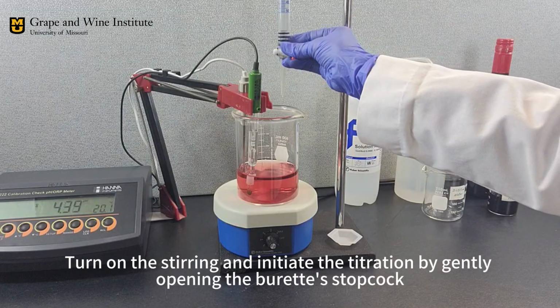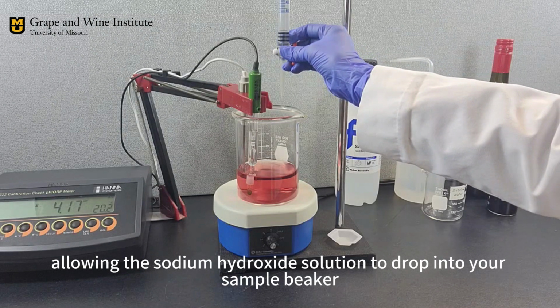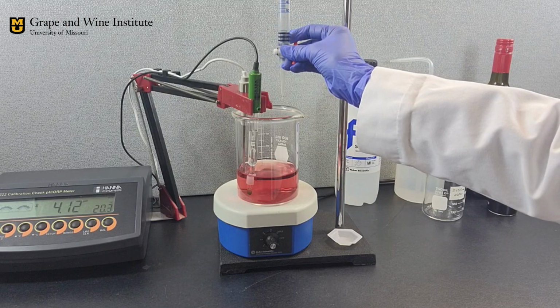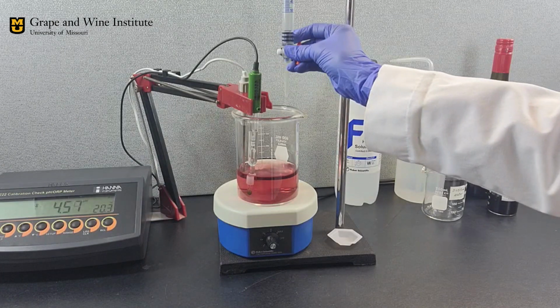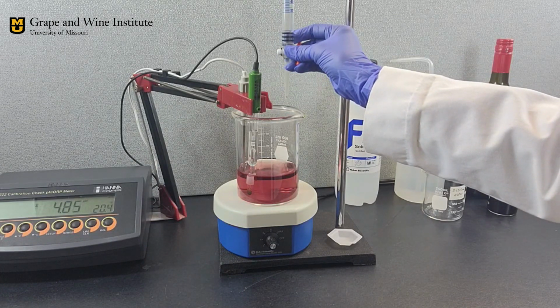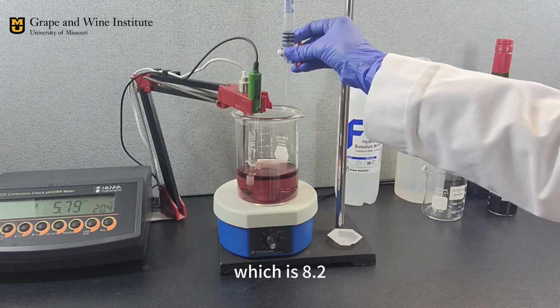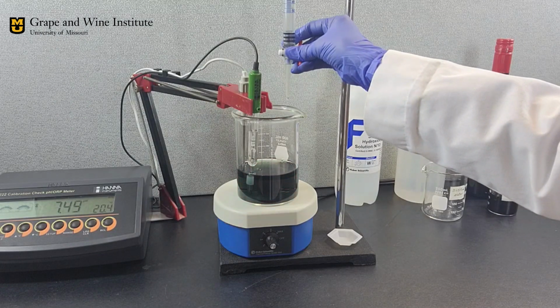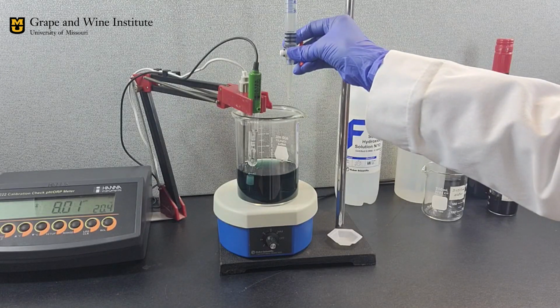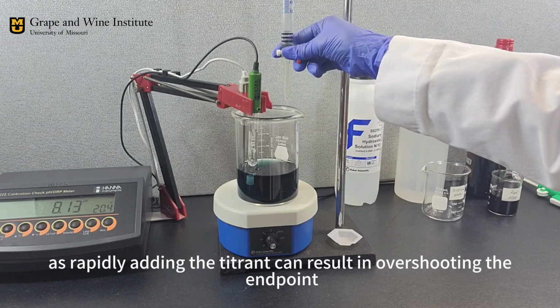Turn on the stirring and initiate the titration by gently opening the burette stopcock, allowing the sodium hydroxide solution to drop into your sample beaker. Continue the titration until the pH reading reaches the endpoint, which is 8.2. Take your time with the titration process, as rapidly adding the titrant can result in overshooting the endpoint.